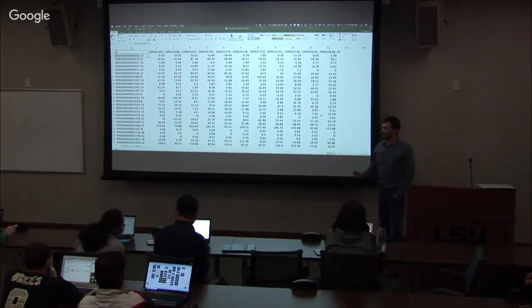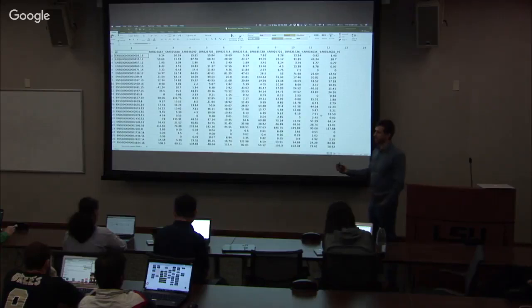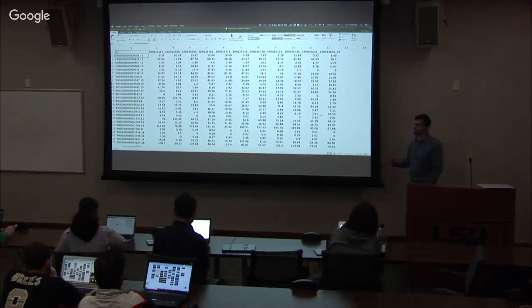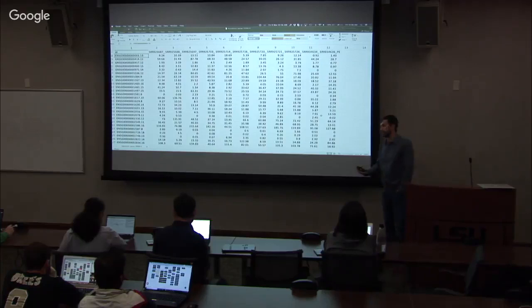But typically, any organism assembly, if it has a GTF, that GTF will have a version. Just like we had GRCh37 and 38, those are versions. And so we decided to use the 38 version. And what you see on the platform are the most up-to-date versions that we have found. But you can also upload your own GTF.